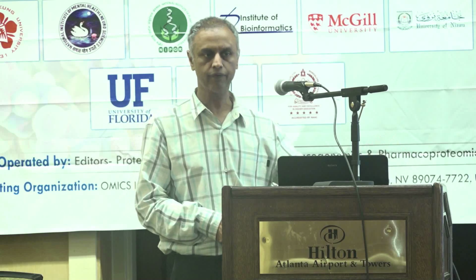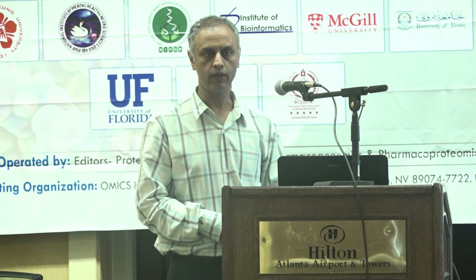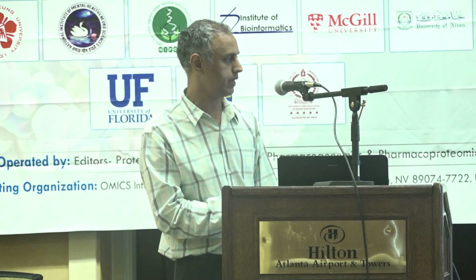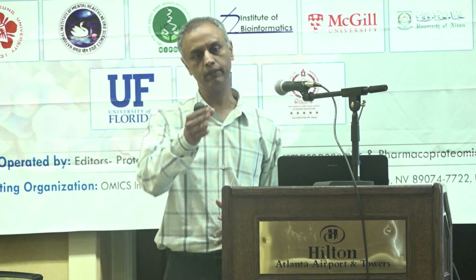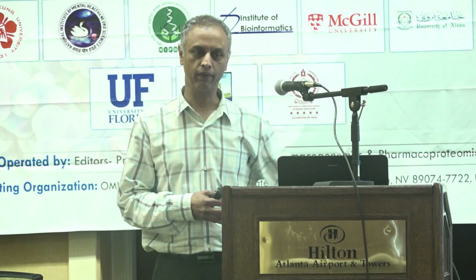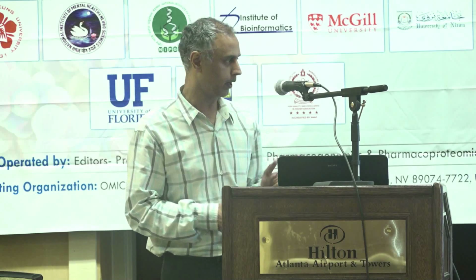But this is a reference strain that has been provided by CDC to our colleagues at Hopkins. We went back with this data to them, and we said, it doesn't make sense. You called it NDM, and we see it's OXA181. They go back and look at their notes, and they say, we are sorry, very sorry, but you are right. We don't need to be told we are right. We have the answer. We are telling them that they were wrong. Okay, so that's one.